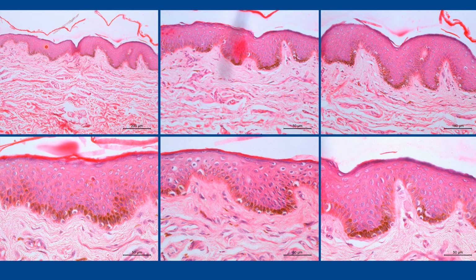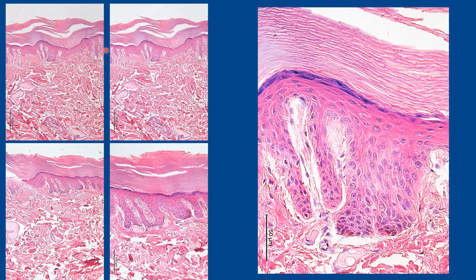This section has already been shown to you. Just to show you the stratum basale containing highly pigmented epithelium, melanocytes and keratinocytes. Thick skin. See the stratum corneum layer, then stratum granulosum and the stratum spinosum, the basal cell layer. Already it has been explained.